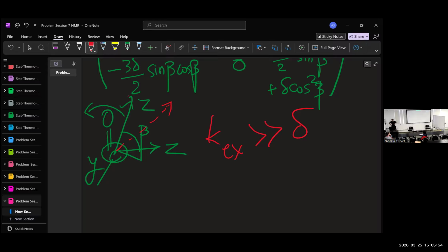Apparent change in isotropic shift because of intermediate exchange. No, I can't say I see. Well, with the cryoprobe, you might see such a thing. Possible. We have to simulate to see that. Yeah, for intermediate exchange, the final answer will always be simulation.